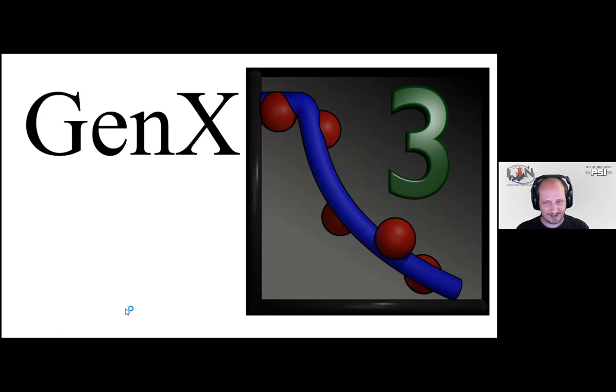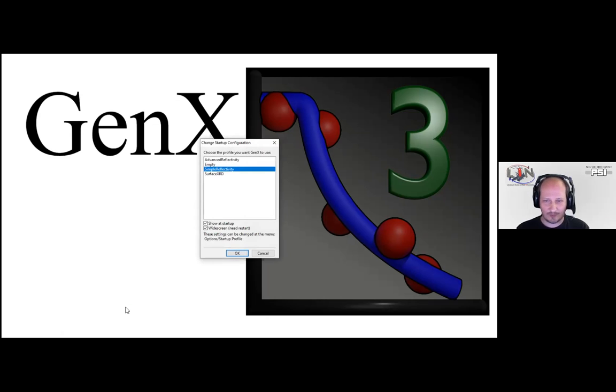Thanks for that. Because the paper is outdated, that's from 2007, I won't show you anything from it, but I will show you how to build that model. Because one of the improvements, or I hope it's an improvement, I made is trying to make an extremely simple beginner's kind of interface to build a model that's not so complex.